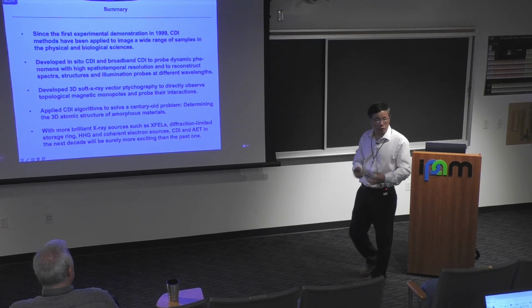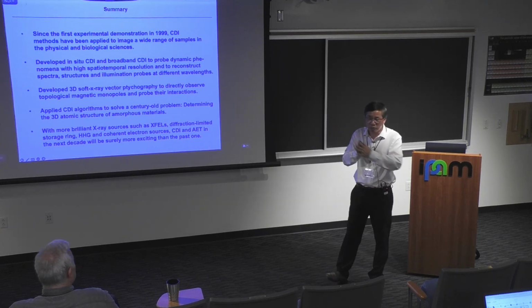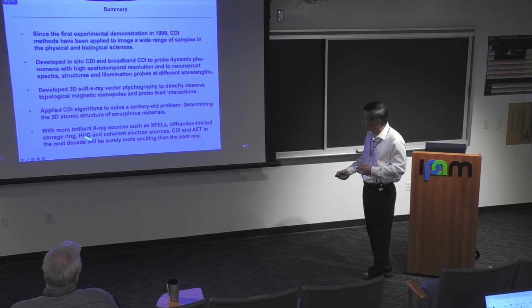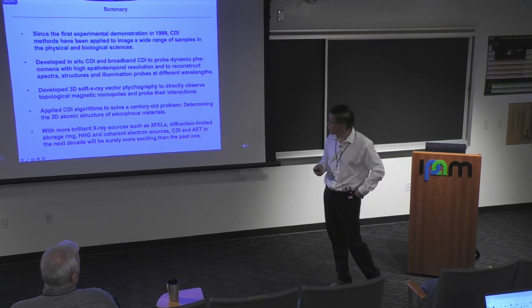And then we apply some of the algorithms, instead of solving the phase problem, we try to get the best 3D reconstruction from limited measurements. We solve tomography order problems. So personally, I feel the future is very bright for this field.